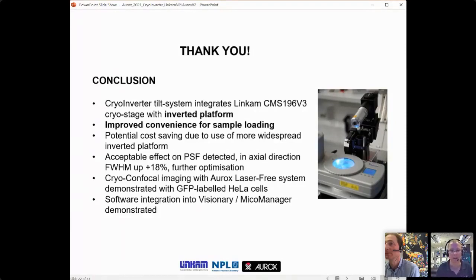They can add the cryo stage and or our confocal without a huge commercial outlay for one of the more integrated platforms. It's a really exciting project that we hope to carry on and finish off and make commercially available to everybody. If anyone wants information, then either contact Michael or you can contact myself as well.